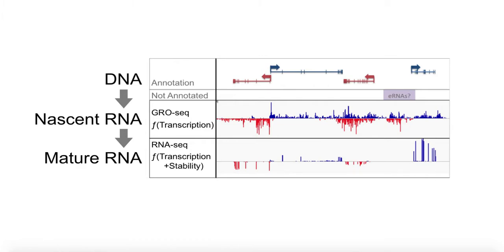It could be 25 kb, 50 kb. It just depends on how you define it and what you define as significant. However, you can see that, as I mentioned in the last slide too, you get this sense and antisense transcription, or what we tend to term bidirectionals. We'll talk about these a little bit more later, and how we can pick these up, identify them, and call them using different modeling programs.